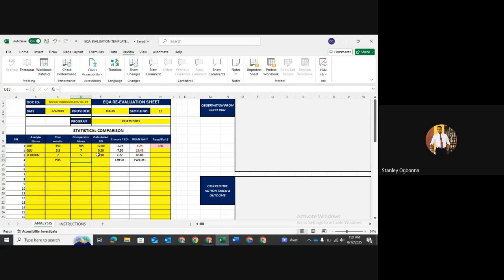If it's not okay, you simply clear those cells by clicking delete. To enter a value, you simply click on the cell and type. To remove something from a cell, you highlight it and press delete, so it clears. Don't try to clear the rows or anything. Just click on the cell and press delete.